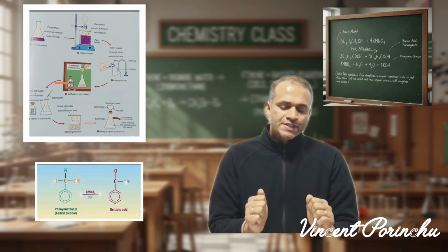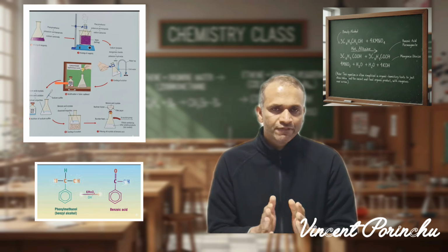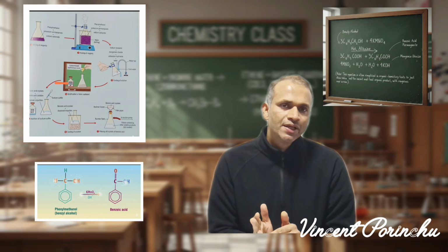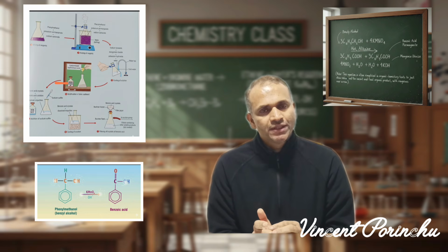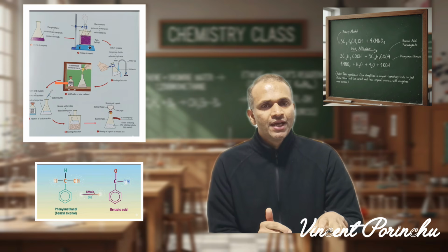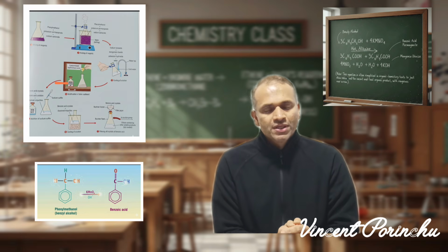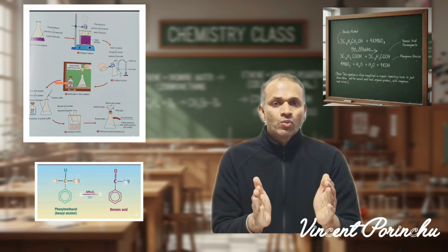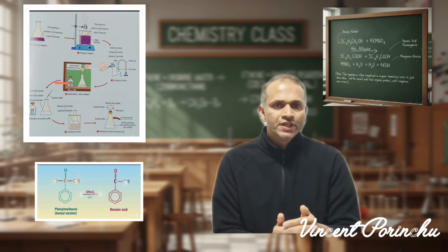So we have 7 steps. The first step, we need a conical flask. In the conical flask, we have to take all these reagents: your benzyl alcohol plus potassium permanganate, some sodium carbonate. You mix these reagents very gently, and in the second step, we have to heat up this mixture. In order to heat up this mixture, we are using a boiling water bath. You can see that in the diagram in this video.